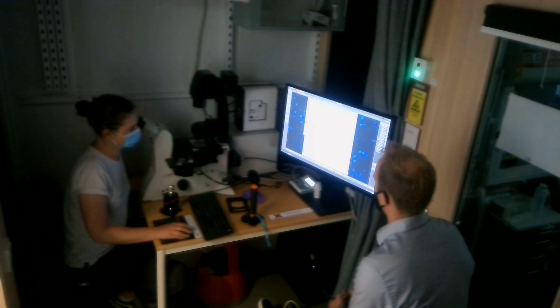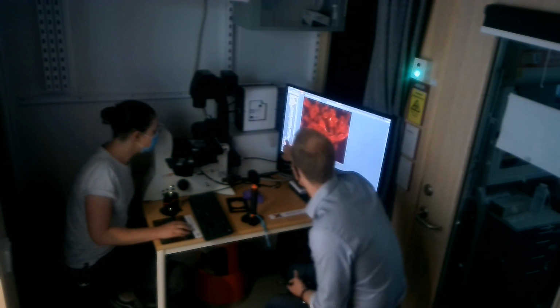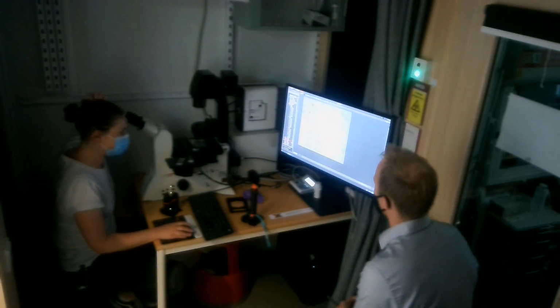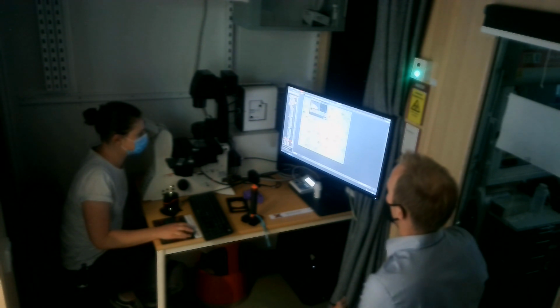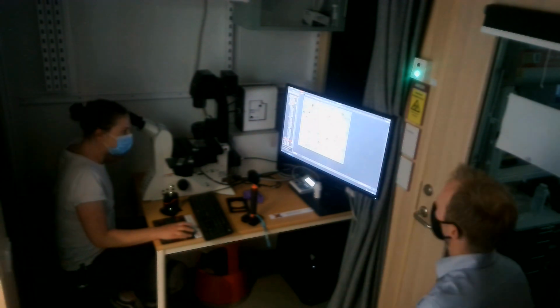Okay. That's nice. And then if I'm in the merge, now there's a lot of stuff in here. I think yours is this image 1 there at the bottom. This one. Yeah. And then I could here start adjusting. Yeah, there you can start working with it. Exactly, there you can work with it. You could also go back into the default interface to play around with the images in there also. Okay, cool.